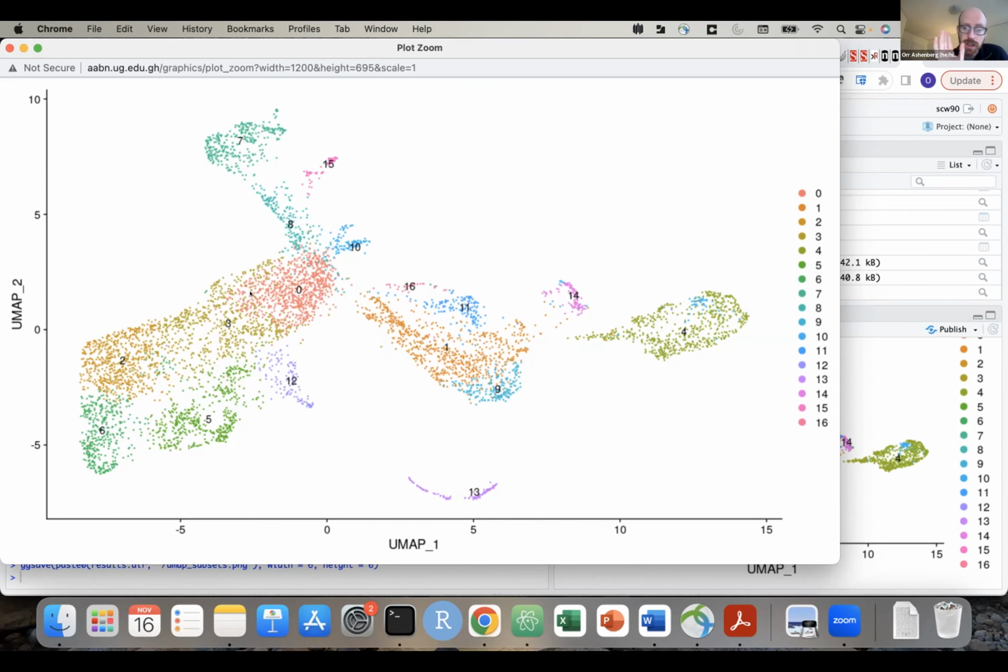So there are two independent operations: building the UMAP or the TSNE, which is really for visualization, and the clustering, which is really this very quantitative way to say which cells are probably in the same cell subset. So they're doing similar things, but the clustering is not happening on the UMAP. The clustering is happening using the PCs and building these graphs and so forth.